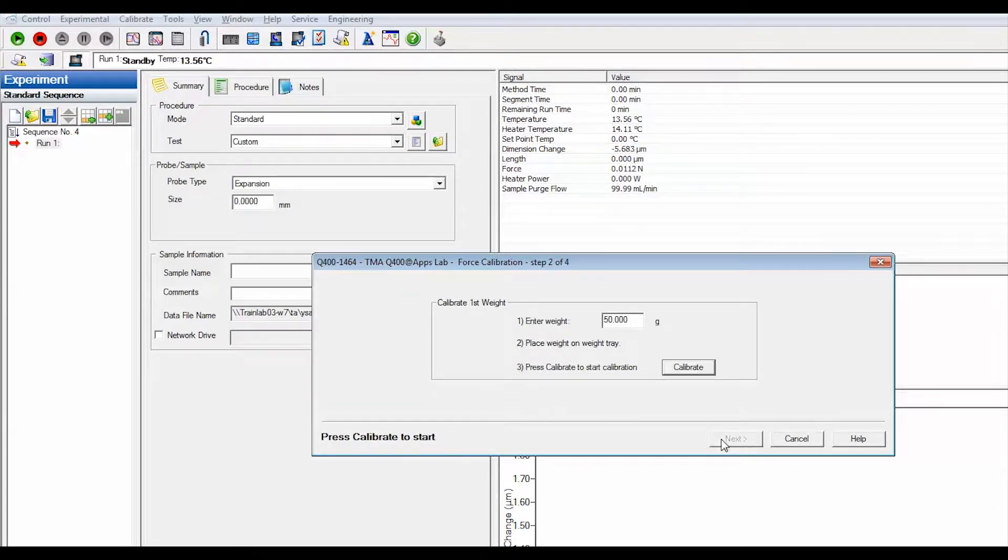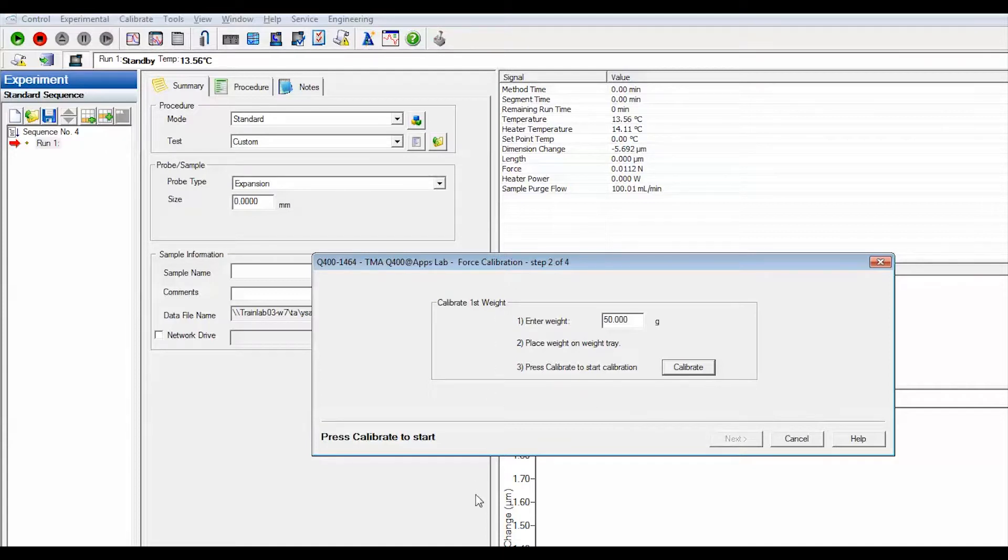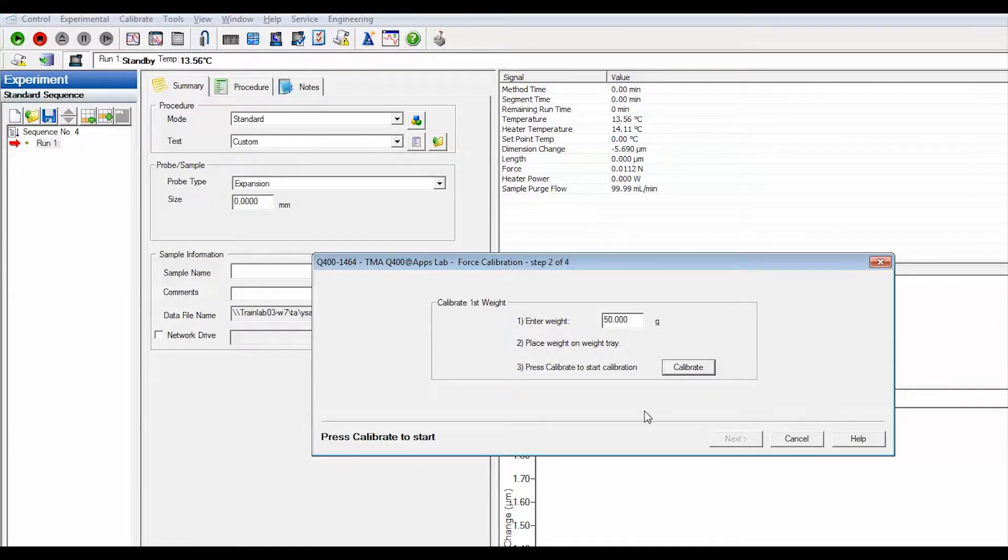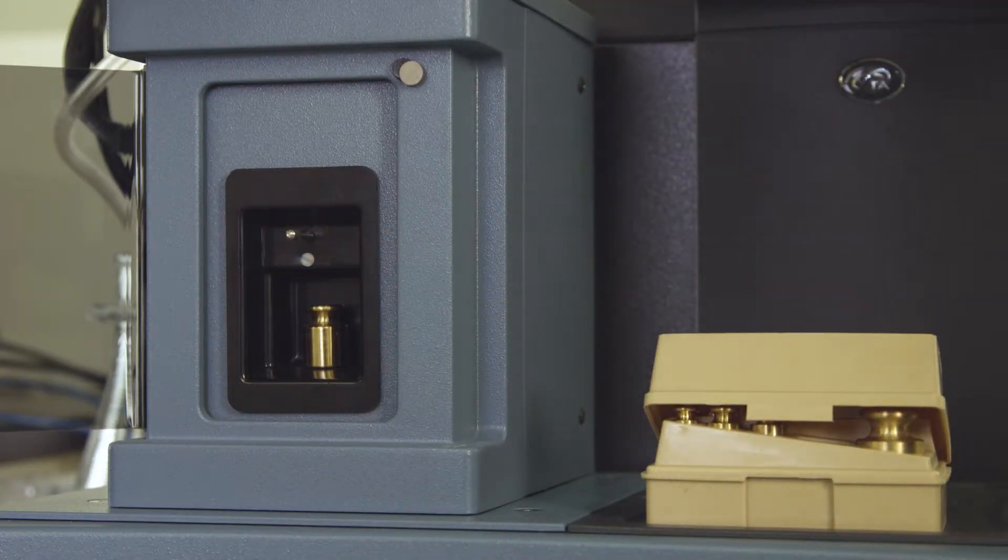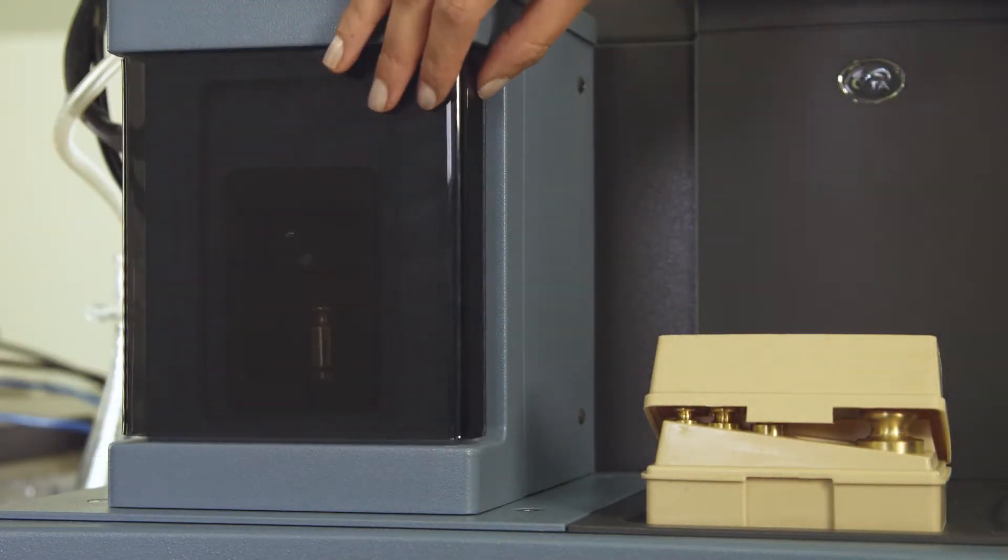The following calibration step is calibrate first weight. The recommended weight amount is 50 grams but you can enter any weight in grams between 10 to 100. Place the first weight on the weight tray.